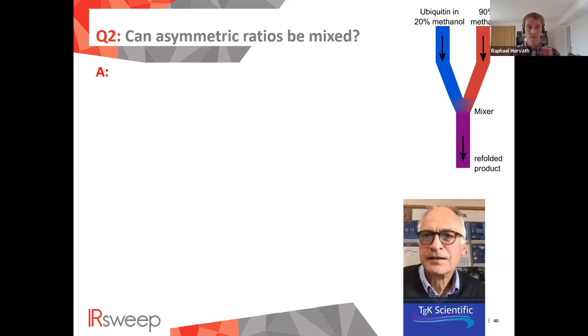I think I can answer this one. I believe Ian Burgess from the CLS, the Canadian Light Source, has actually done something quite similar, and I think their paper came out just last week, where they used a single crystal, a silicon ATR crystal, and they bounced the light through the inside and measured at the top. I think they did electrochemistry on the top, so you can certainly do it, and you can certainly probe thin layers that way. I don't know of anybody who's bounced it off the outside of a crystal, for example, but it could certainly also be done.